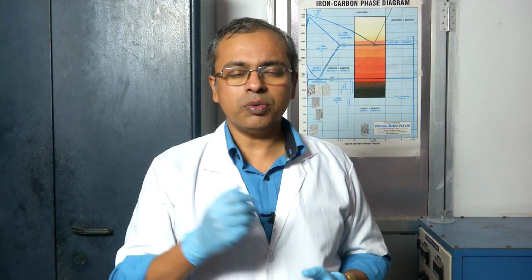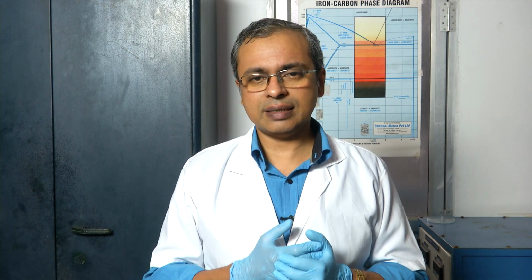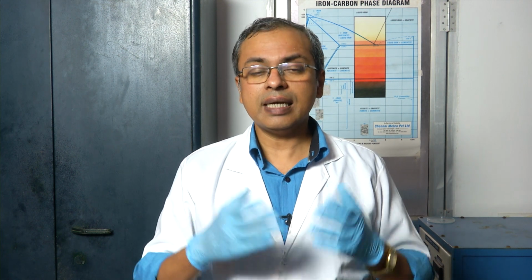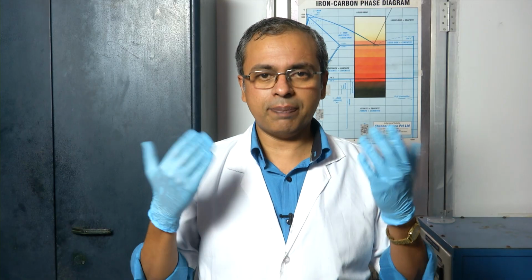The third most important thing, I would even say it is the most important thing, but the third one that I am going to talk about is safety glasses. Okay. As you can see, I am already wearing a pair of glasses. A lot of people assume that once you wear a pair of glasses, you do not need to wear anything else. In fact, that is a very wrong notion.